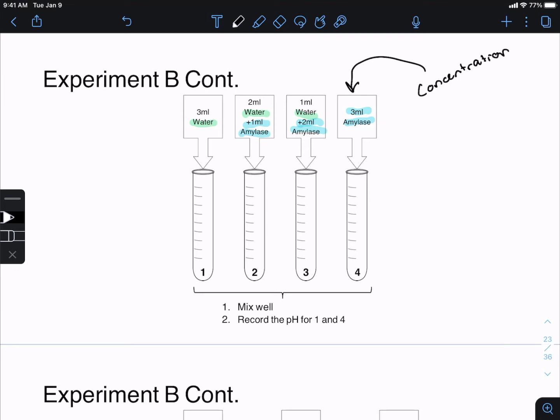This one is full concentration. This is the maximum concentration that you have. It's whatever the bottle happens to contain, whatever that concentration is, because you're putting it in full strength, right? Full strength. But this one, you've diluted it, so now that's not full strength. That's essentially 2/3 of full strength.